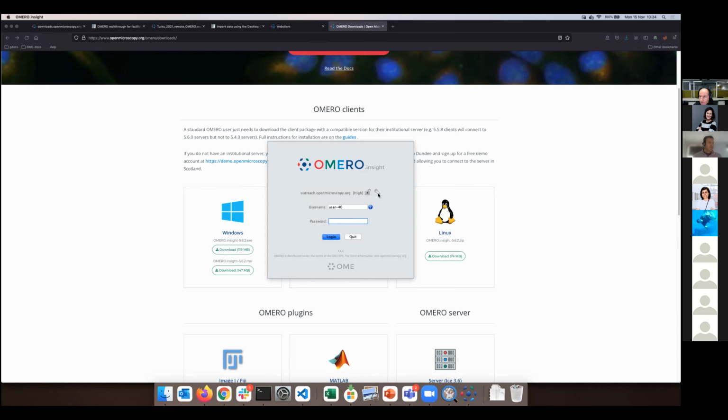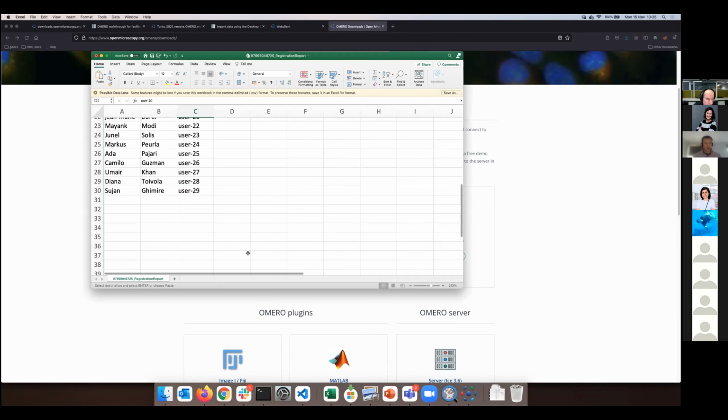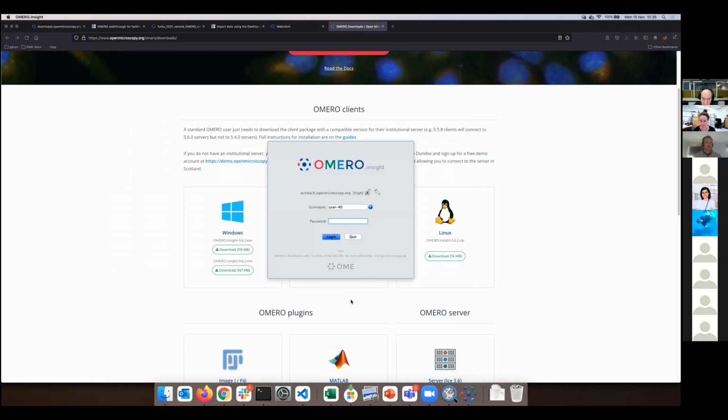Sorry, Peter, which one was the highest number you gave in the list? I missed that. 29 or 30? 29. So if you use 31 and user. Yeah, exactly. In the list, the last highest user is 29. So this is what Joanna sent, and for those of you joining later, ladies and gentlemen, you can use the high numbered users except user 40, so anything between 30 and 50.